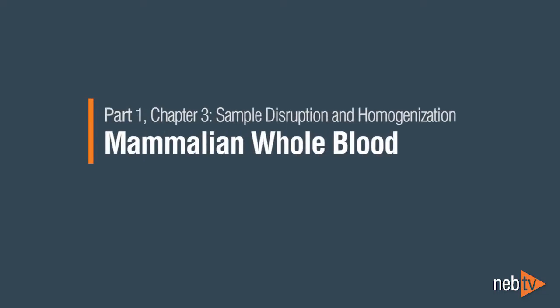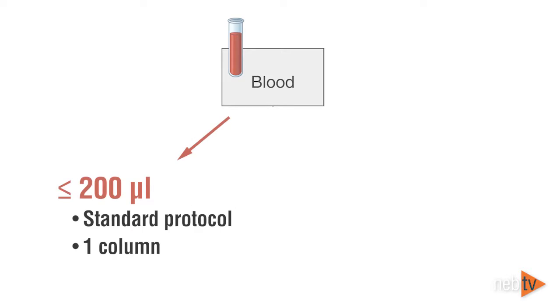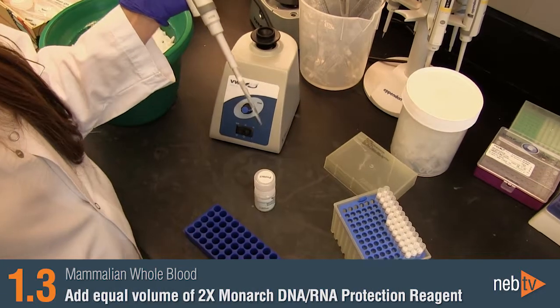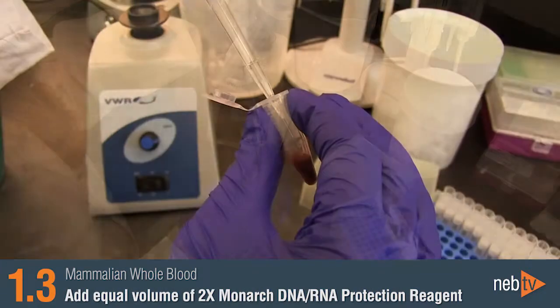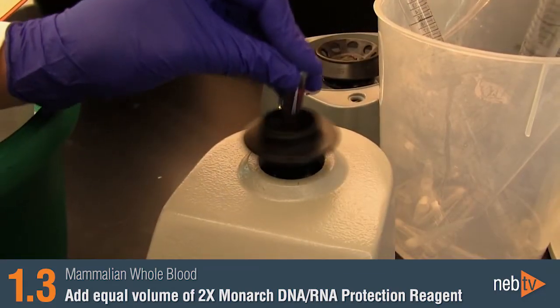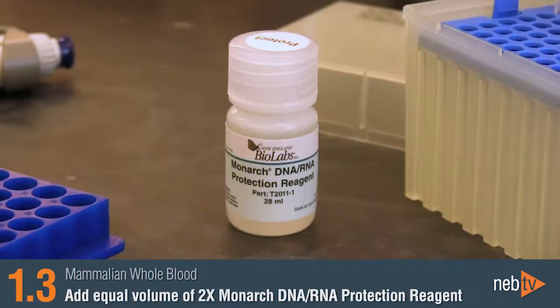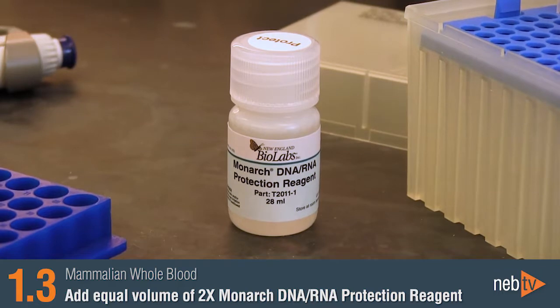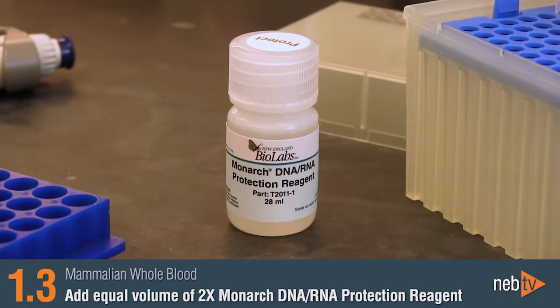Part 1: Sample Disruption and Homogenization for Mammalian Whole Blood. For a standard prep, up to 200 microliters of whole blood is processed. Up to 3 mLs of blood can be processed on a single column, but will require scaling the corresponding reagents and reloading the column. Starting with an aliquot of whole blood, add an equal volume of the 2x Monarch DNA and RNA protection reagent to the sample and vortex briefly to mix. For frozen aliquots, add an equal volume of the 2x DNA-RNA protection reagent to the frozen aliquot and thaw quickly with vortexing or shaking.